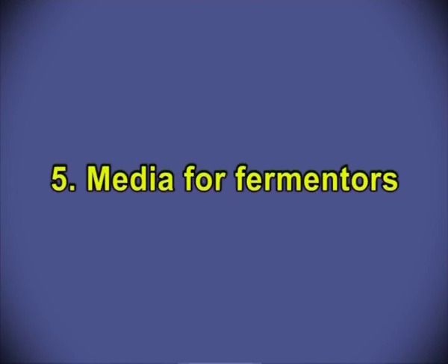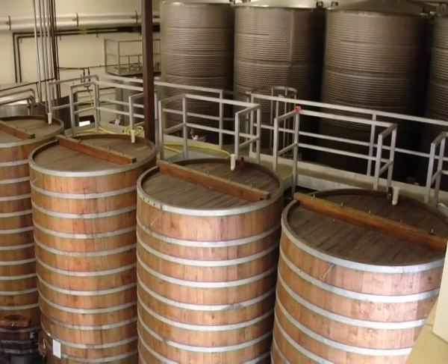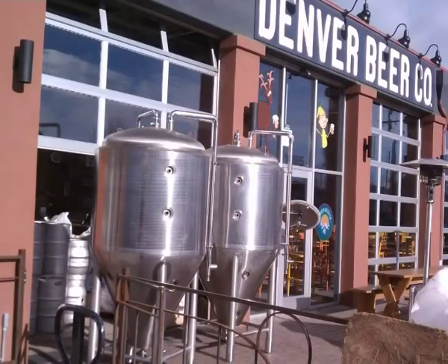Coming to the last one, that is media for fermenters. Most fermenters require liquid media, often referred to as broth, although some solid substrate fermentations are operated. In most industrial fermentation processes, there are several stages where media are required.